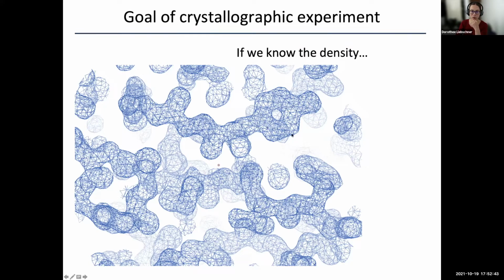And maybe for those who are biologists or biochemists, can you recognize what kind of amino acid could fit into that density? We have, the Zoom has this chat function. Can you maybe type your guess in the chat function? What kind of amino acid would fit here? Any one of the participants?